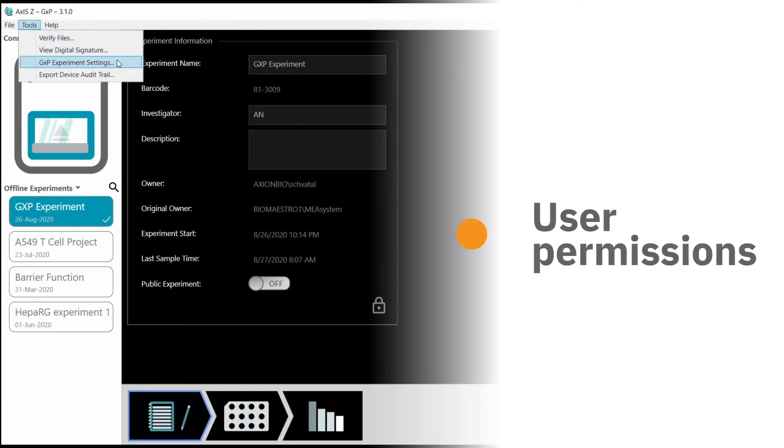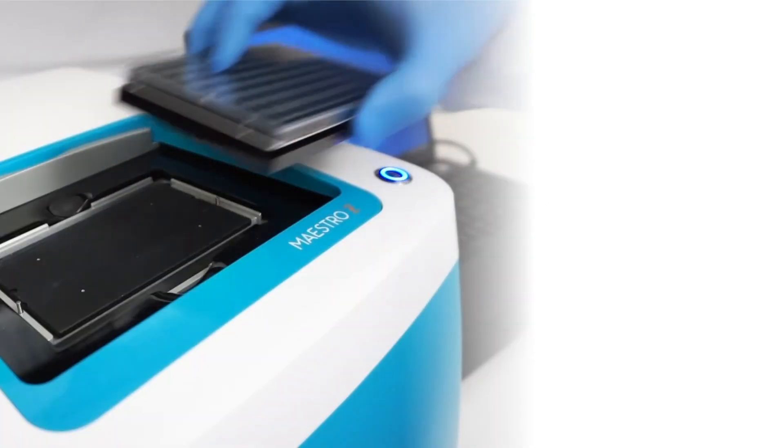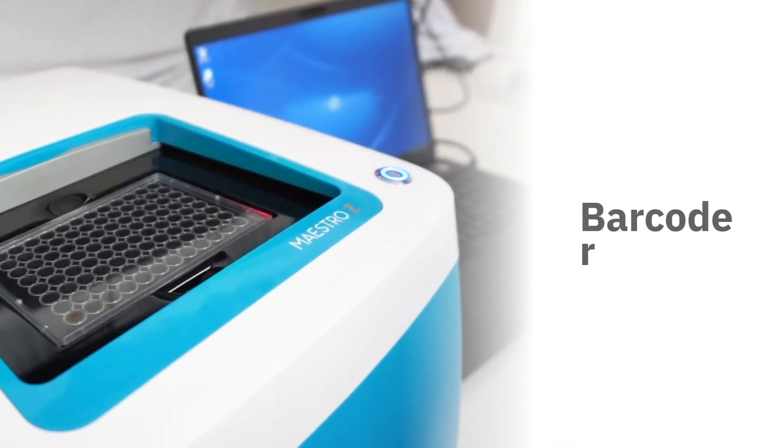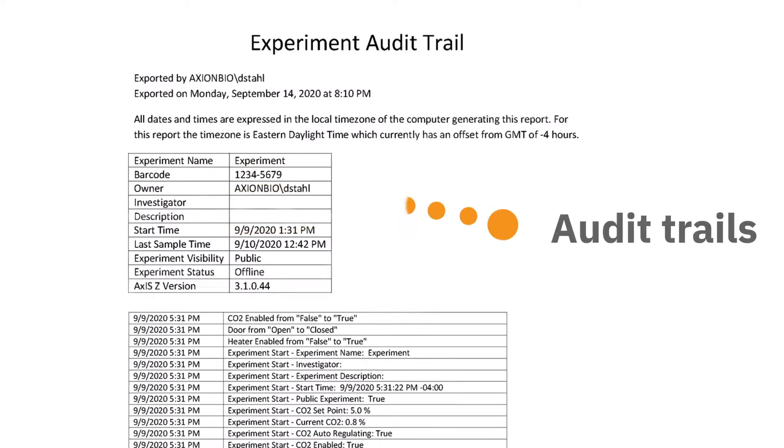The Maestro Z's software user permissions allow administrators to control who in your team can make changes to experiment settings. The integrated barcode reader ensures all data is automatically associated with the correct assay plate. Audit trails mean you know who did what and when in your experiment.